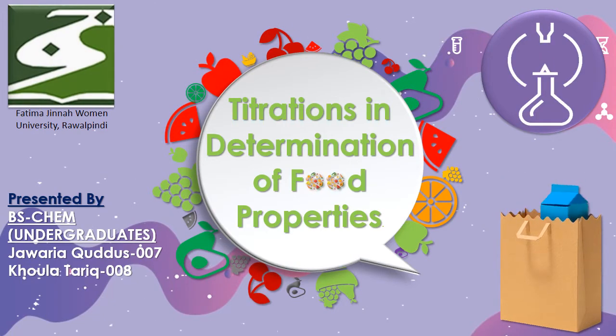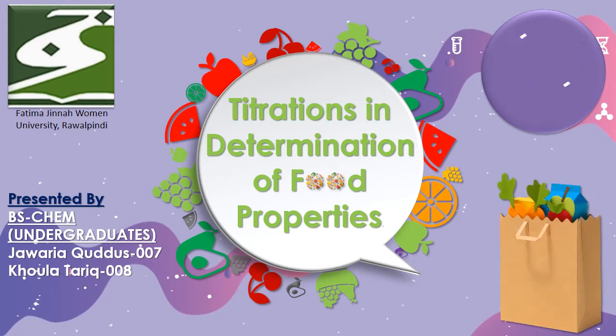Today we'll see the titrations in determination of food properties. In colleges, almost all science students learn about titrations. It's not just a chemical experiment that we do in colleges, but it has a wide range of applications in different industries and in different aspects of our daily life.